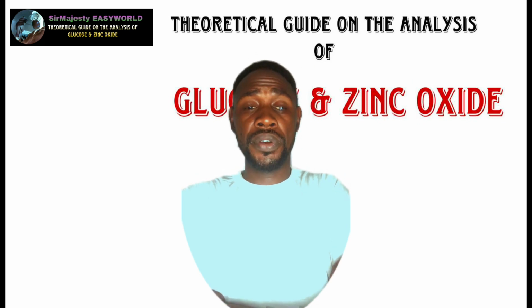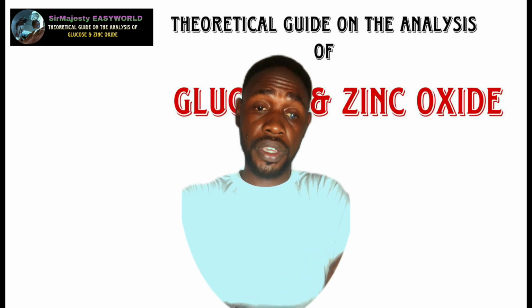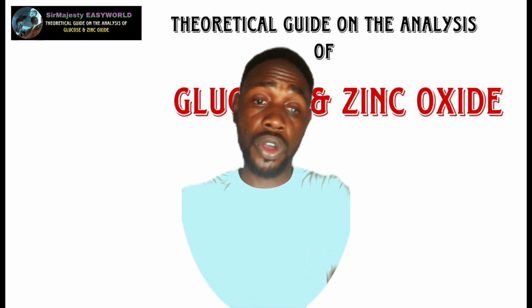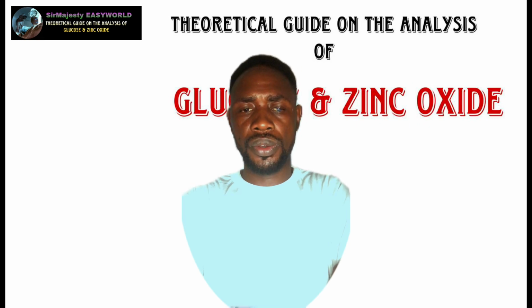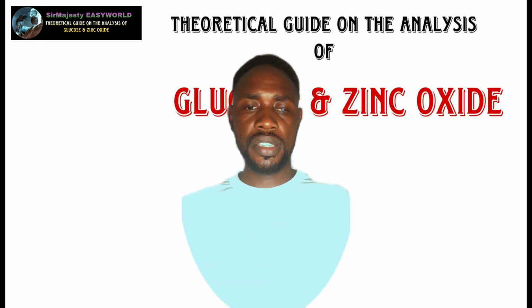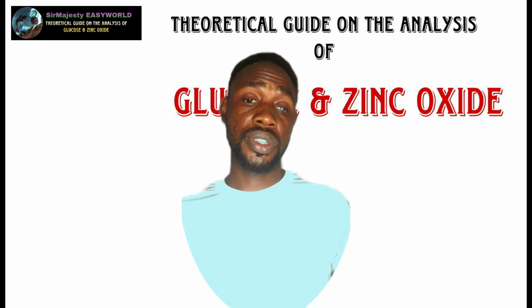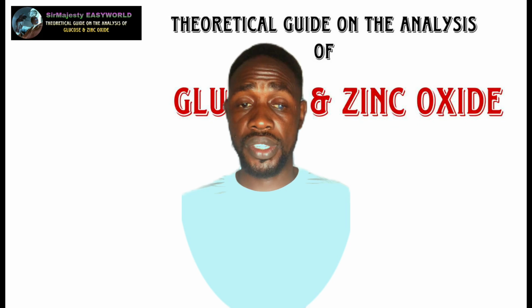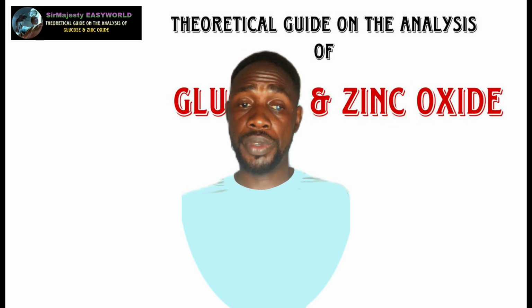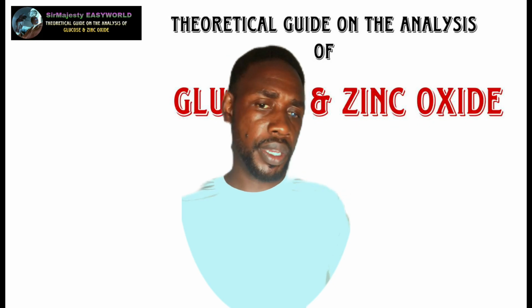And then for zinc oxide, you should just know that zinc oxide, on the action of heat, turns yellow, then on cooling it turns white. So you might be required to heat this zinc oxide, and it's very simple. In some cases you might also be required to dissolve it in acid, then test for the zinc(II) ion, but that's going to be rare. But just know that zinc oxide is also a pigment in some paints and has other uses.